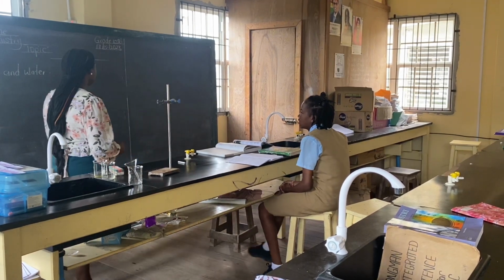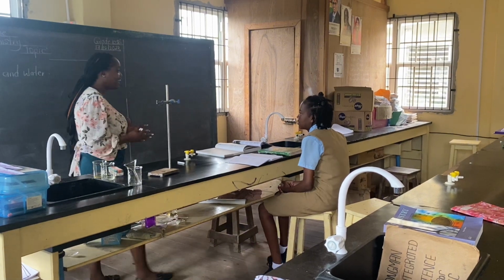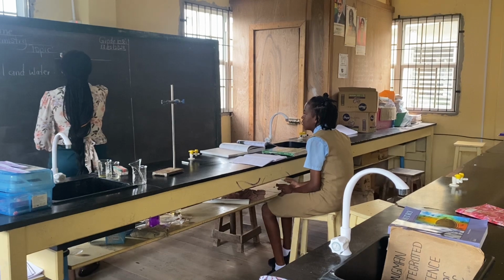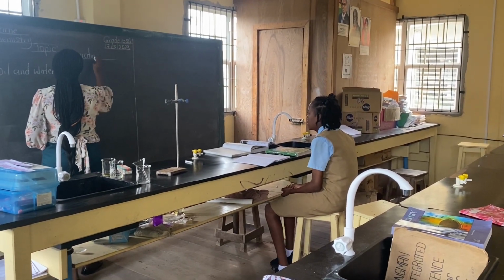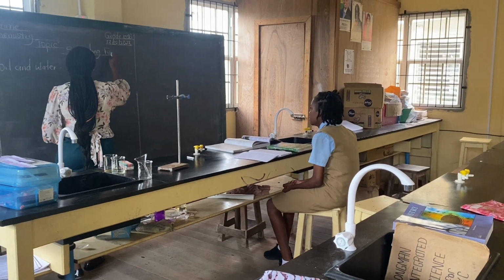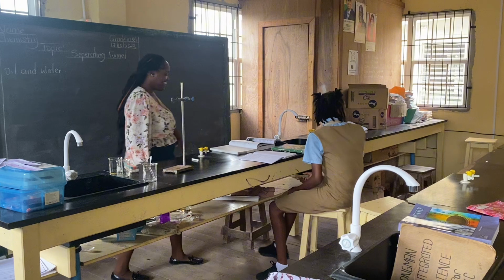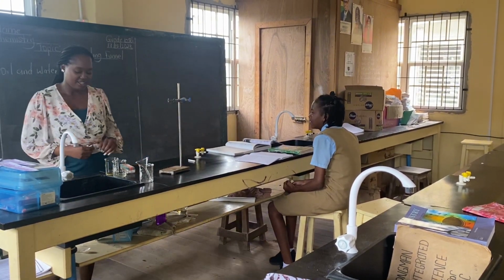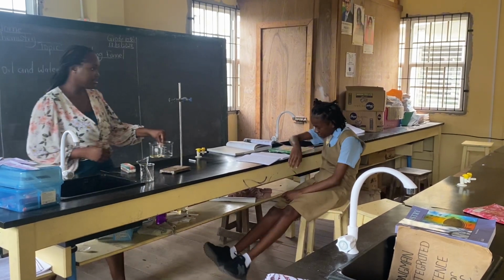In order to separate oil and water, we will have to use the separating funnel, and that is our topic for today. So, oil and water, we can use the separating funnel.